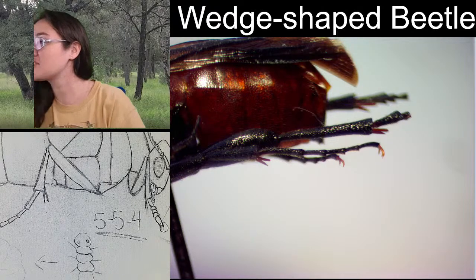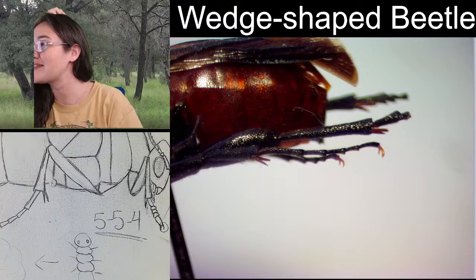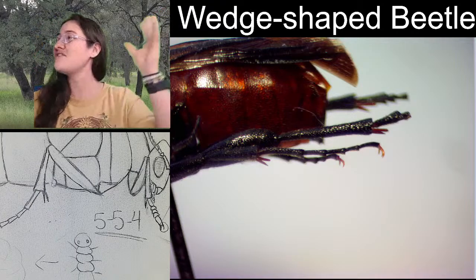A spur is inserted into a socket and is movable, while a spine lacks a socket and is fixed. Thank you, Hashi!